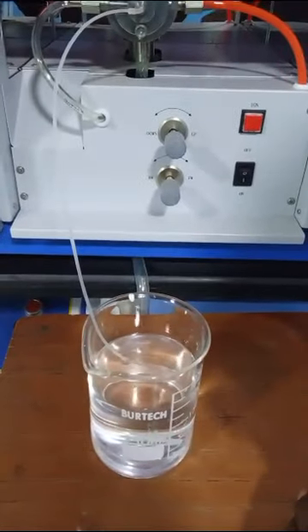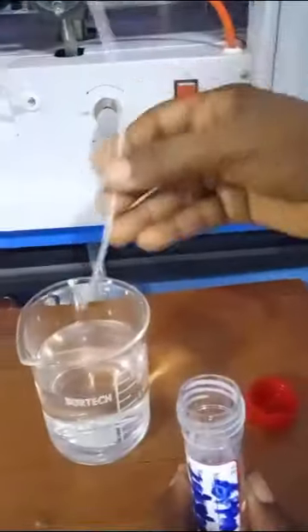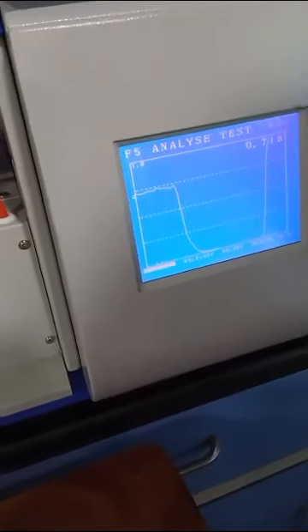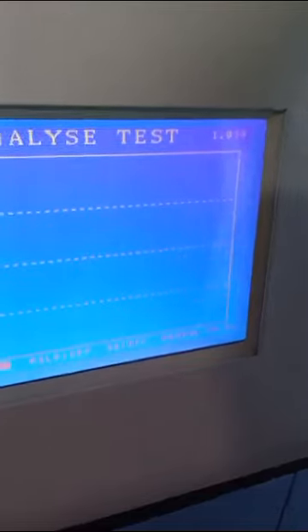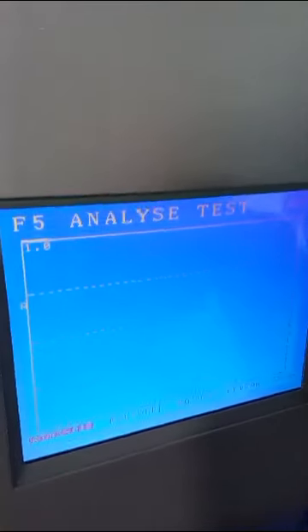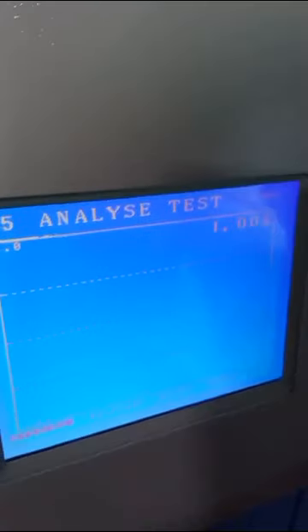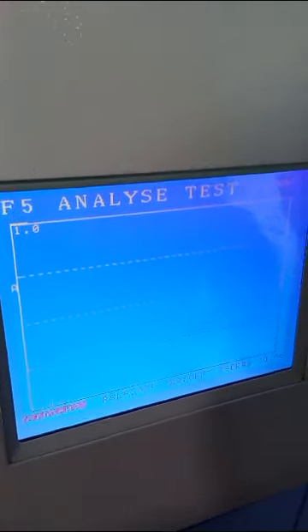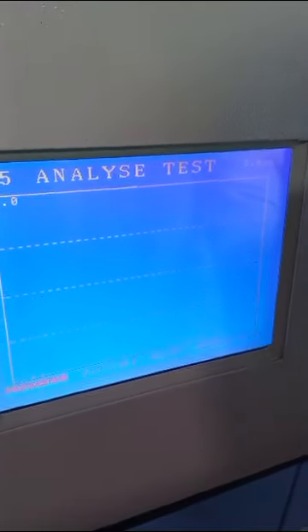So now this is our 6 ppm. So we are going to repeat the same procedure for this also. Can you see the wavelength is changing drastically? So we are going to read it again. We wait for the question to pop up here. Now you can see the question, then we press enter. We repeat the same thing. We wait for the question, and again.